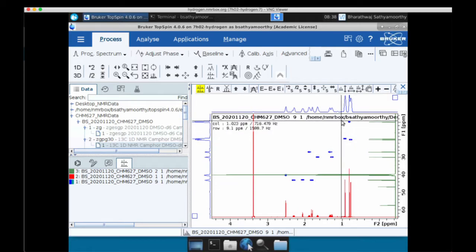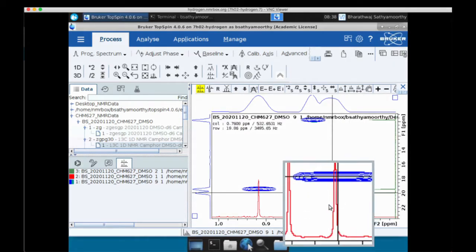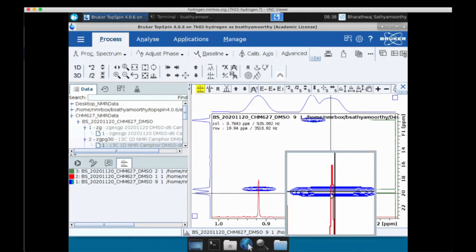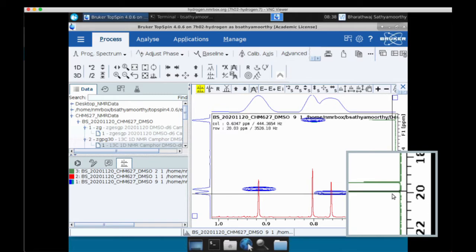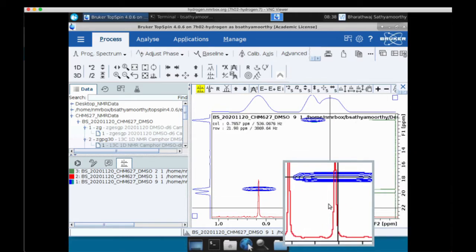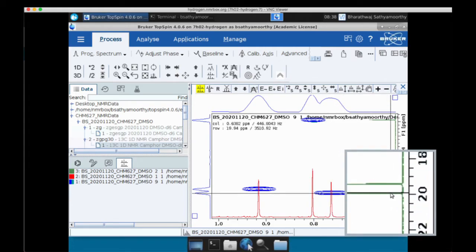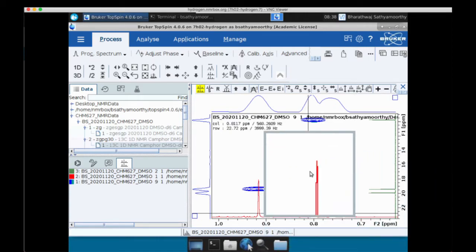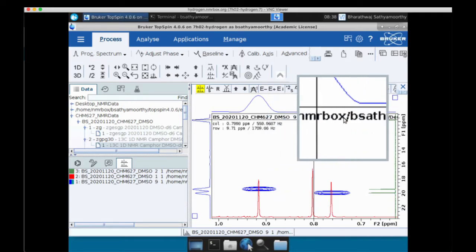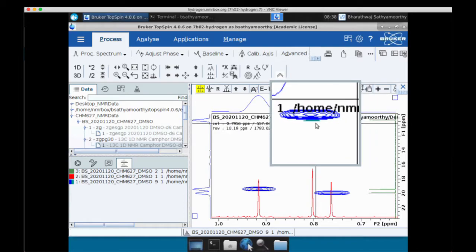And if you zoom in, for instance, to the methyl groups, what you're able to clearly see is that this given methyl group that gives a two-dimensional CH resonance indicates which carbon it ends up interacting with. Basically, that is at 0.76 ppm ends up having a carbon whose chemical shift is at close to 20 ppm. On the other hand, the resonance that is present here, which is at 0.8 ppm, gives you a cross peak which has a carbon resonance at 10 ppm. So this helps you understand how two one-dimensional experiments, when correlated in a 2D fashion, help you assign the proton and carbon spectrum easily.